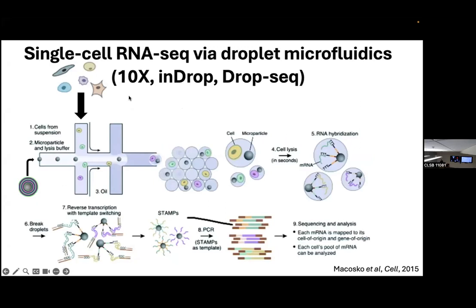The actual microfluidics part looks somewhat like this. So it's a multi-chamber channel, as you saw in that animation, where materials flow from left to right. In one channel, there's all of the barcoded beads. In another, your single cells come in. And then in these oil droplets, at some frequency, they will get co-captured one and one.